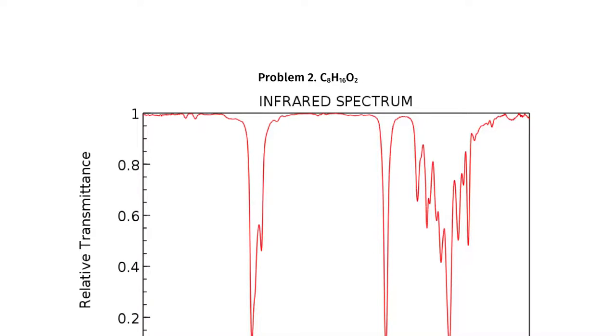I typically start with IR spectrum because it actually doesn't give you that much information, and that's both good and bad. Okay, it doesn't give you much, but whatever information it gives you, it's solid. Okay? Well, the other plus of IR is that other atoms than carbon and proton are involved, and you can observe them.